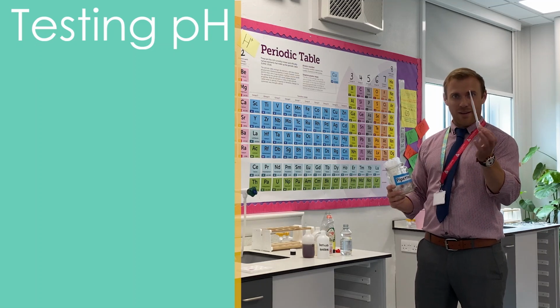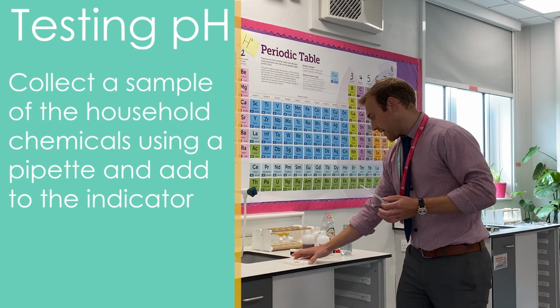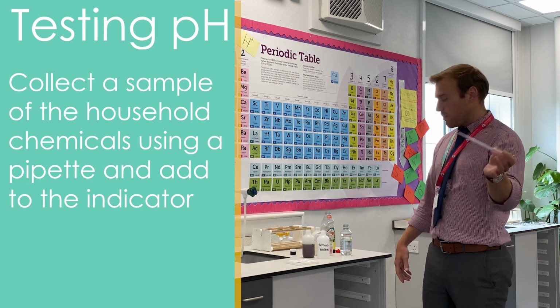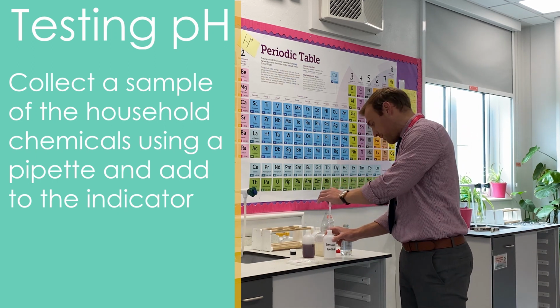So each student will have a pipette like this, and once you've got your dimple tray, you can then collect a sample of one of the household chemicals using your own pipette so you don't cross-contaminate the chemicals. So I'm going with vinegar first of all.